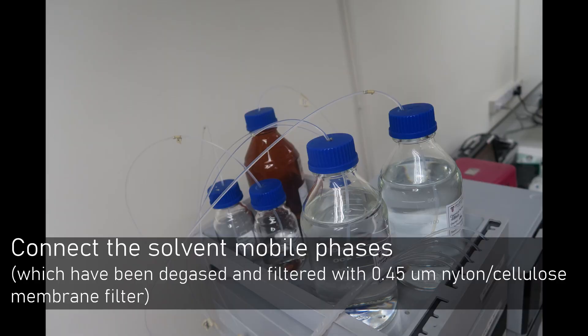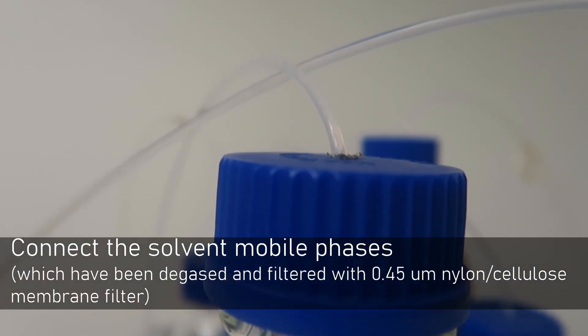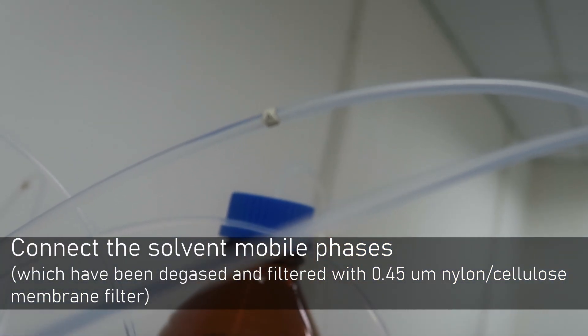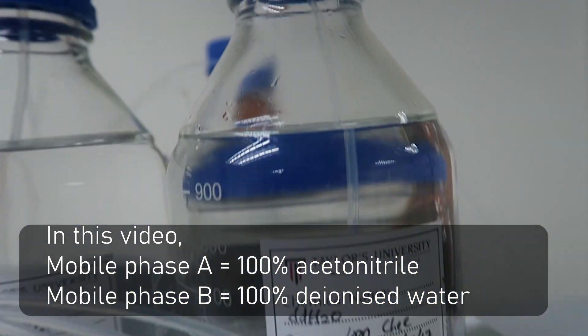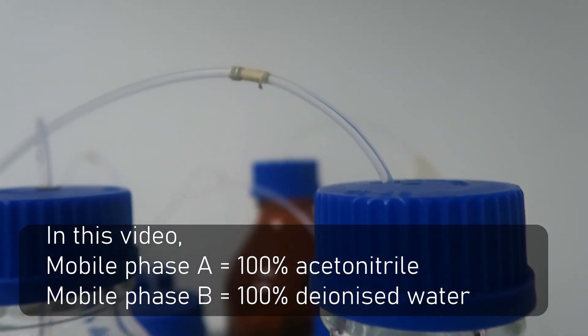Next, connect the solvent mobile phases with the correct tube and filter with the correct membrane filter. In this video, mobile phase A refers to 100% Acetonitrile while mobile phase B refers to 100% Deionized Water.